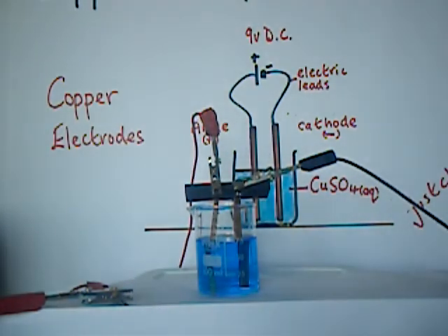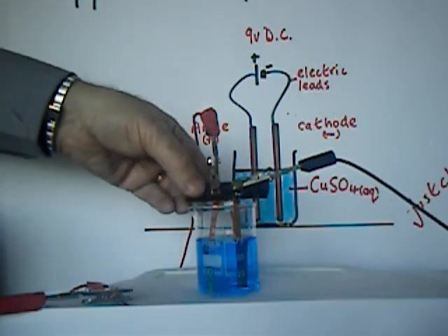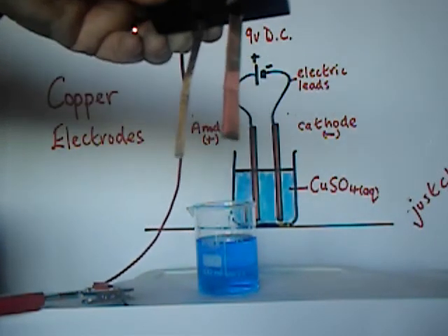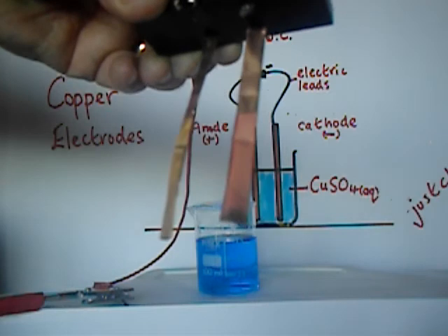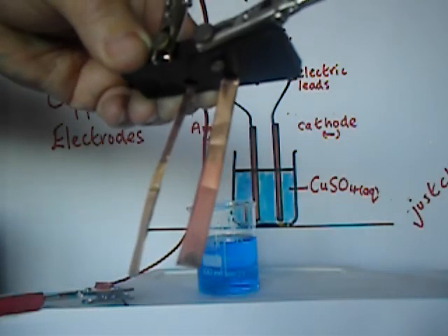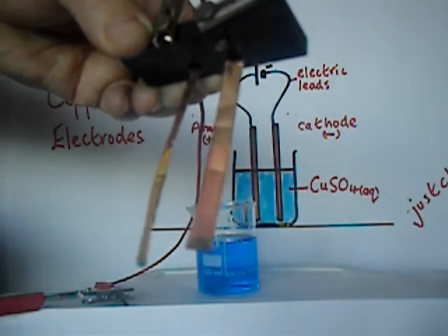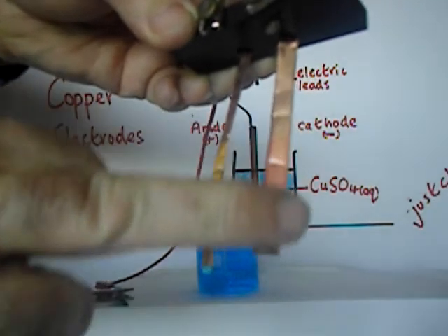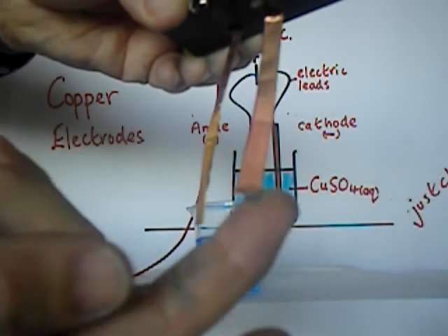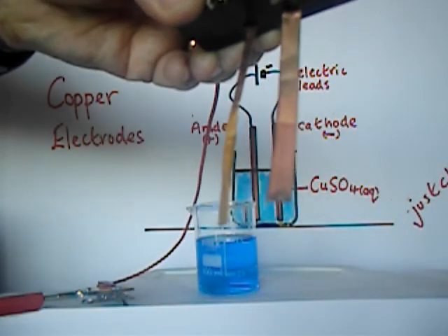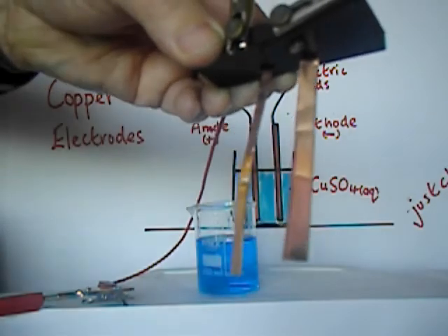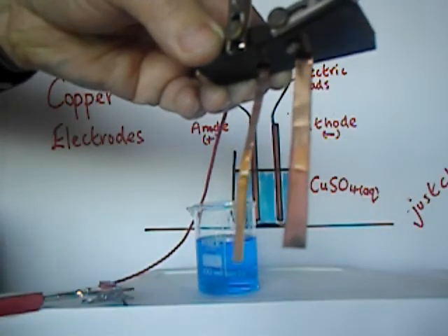This has been running now for probably a minute or two. You can move it to see if there's any noticeable change here. And I do think you certainly see a noticeable change there. If I switch it off momentarily, and if I rub this here with my finger, you can begin to see a deposit of copper forming there. Fresh copper is forming on the right-hand electrode, the cathode.